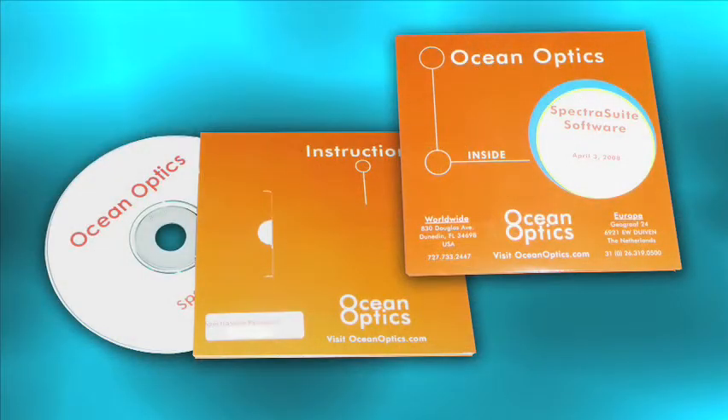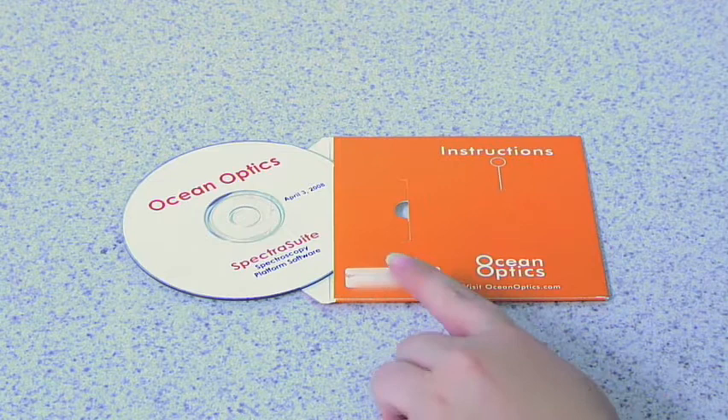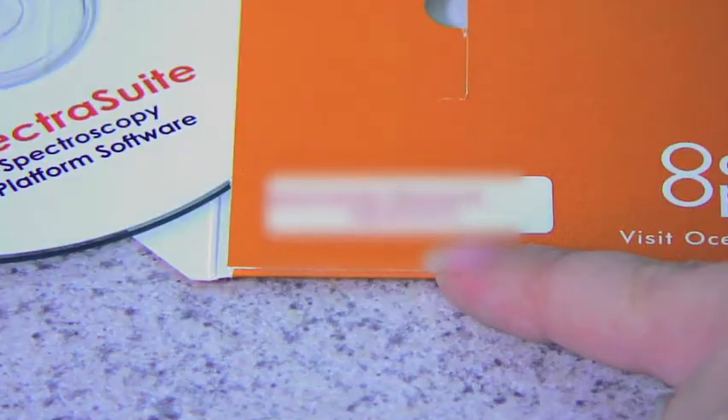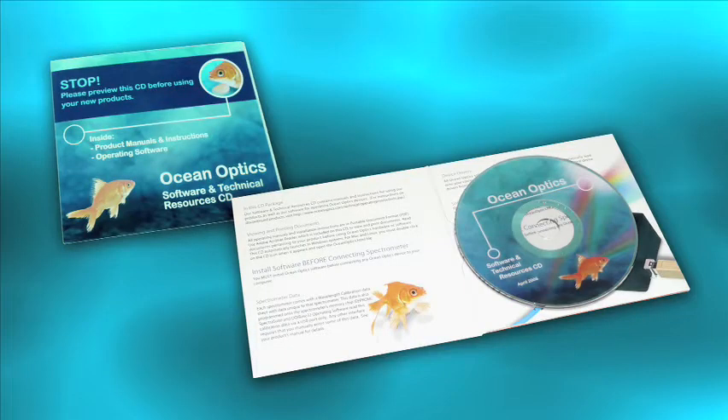You'll also receive two CDs. The bright orange sleeve contains your SpectraSuite operating software. Flip the sleeve over to find your SpectraSuite password. You'll need this in just a minute, and it's a good idea to jot down your password just in case you ever need to reinstall your SpectraSuite software.